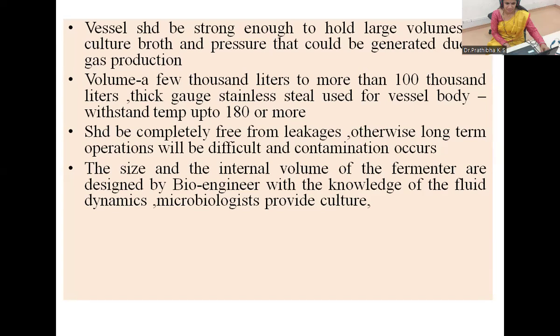It's a collaborative work. A microbiologist alone is not doing all the work. Microbiologists, biotechnologists, bioengineers and fluid dynamics specialists, by taking the knowledge of all these people, design this particular bioreactor or fermenter vessel.